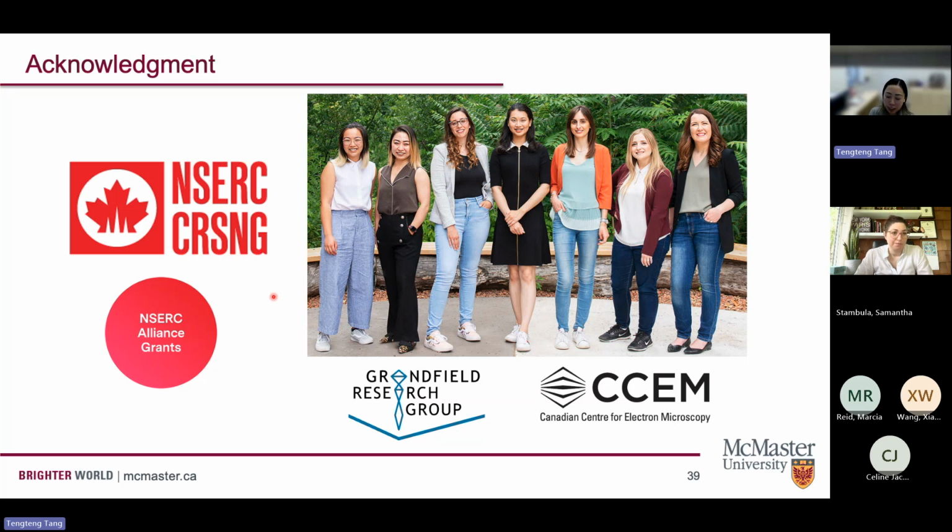Of course, the APT part is out of my expertise, but I think there's definitely some interest there in how we can go all the way from the XRM down to the atomic level.